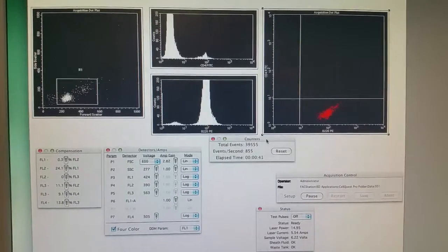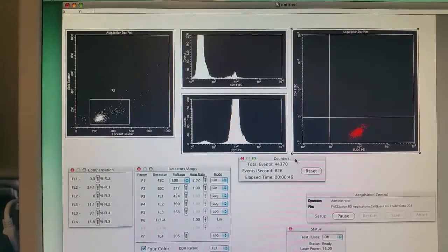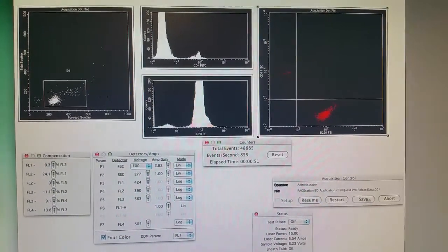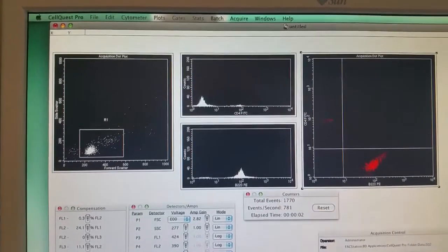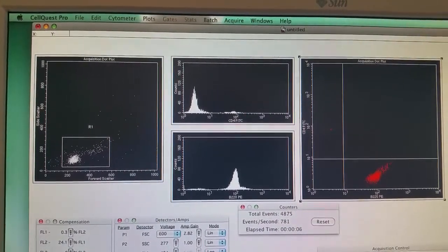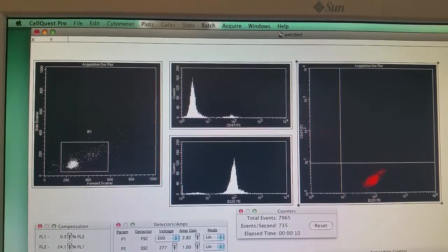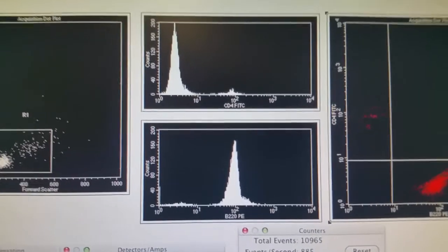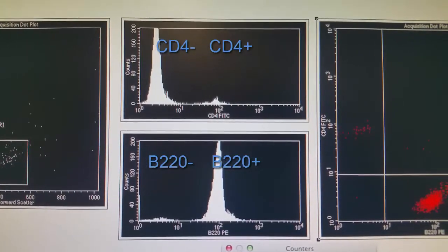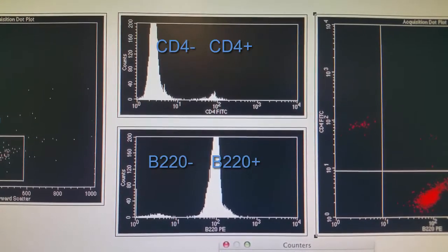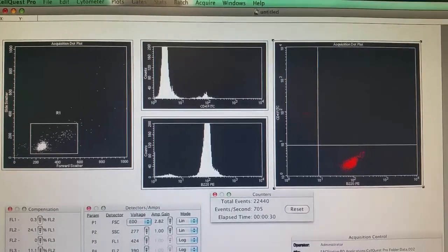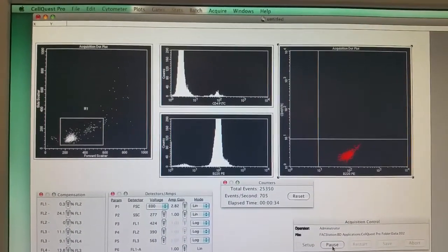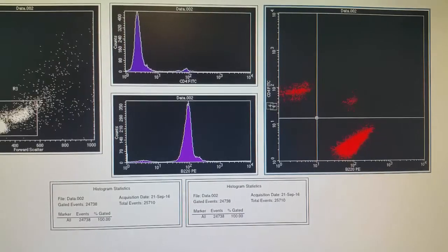I pulled up the counter so we can see how many cells have gone through the machine — we're just about at 50,000 cells that have passed by the laser. So I'm going to pause this and save our results. It saves all of the cells, and we can see all the cells that have gone through the machine. Now if I restart the program, we can see from the very beginning that as the cells pass through the laser, the histograms grow. It's very clear to see that the majority of our cells are not positive for CD4, while the majority of the cells are positive for B220, as shown in the bottom histogram.